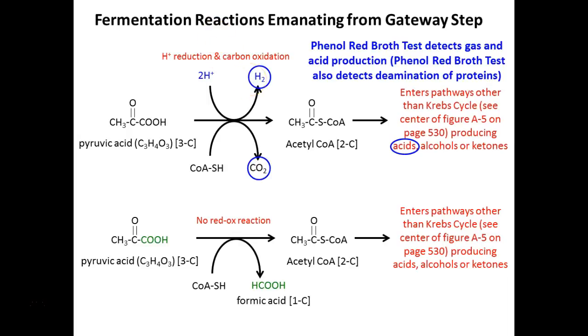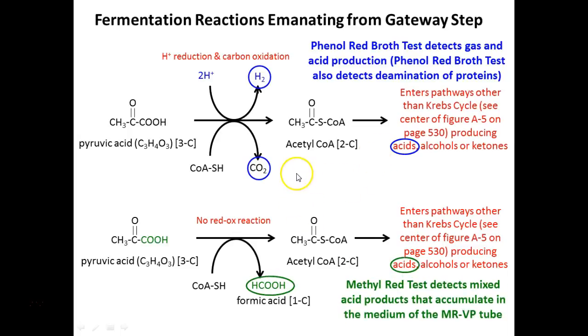But as we know, aerobic respiration produces carbon dioxide, but so can fermentation. So in your little tubes, we don't know if it's hydrogen, carbon dioxide, or a mixture of both. It depends on your organism and the pH of the media when it was fermenting. So we know it's one of these two possibilities. Lots of acids can be produced and some alcohols can be produced.